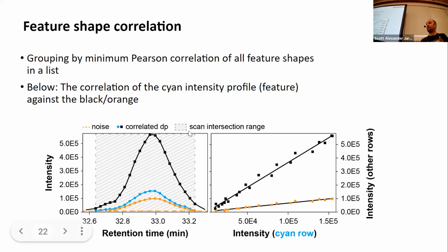That way we could easily say, hey, this is M plus sodium, or this is M plus ammonium, or it might even be an in-source fragment with a water loss, right? So here, think feature-based molecular networking, or actually ion identity molecular networking, not only establishes connectivity based on the MS2 level, but also on the MS1 level through these co-elution profiles.